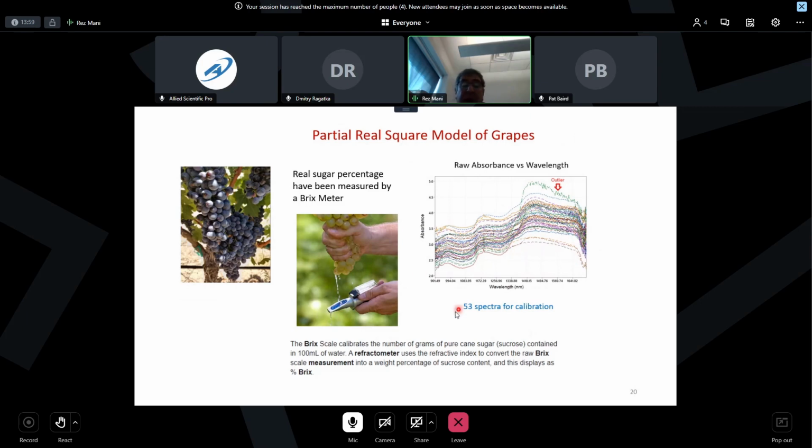And these are the spectra. Right off the bat, you can see by visual inspection that this is an outlier. So it's good to first visually inspect and remove the outliers from the set of spectra. There are also methods in chemometrics to determine what the outliers are, but some of them are very obvious, like this one, which I have already removed.